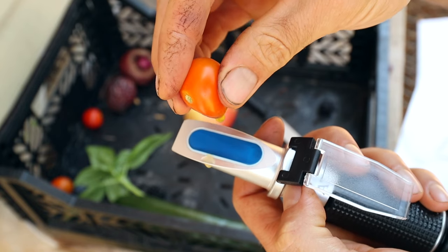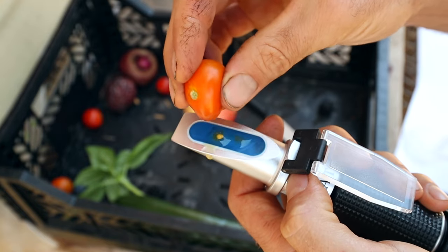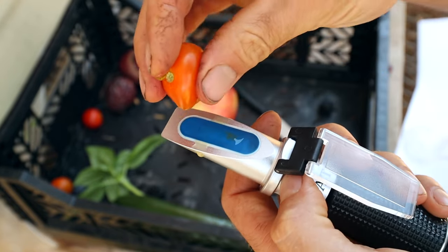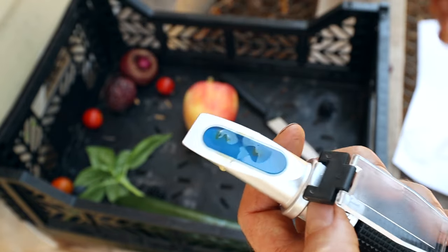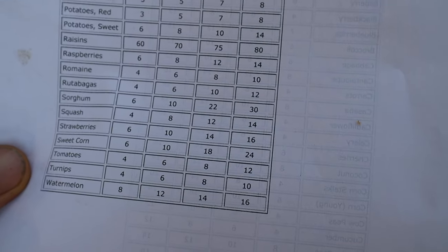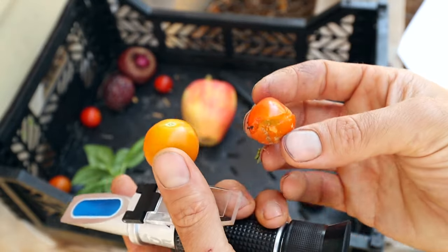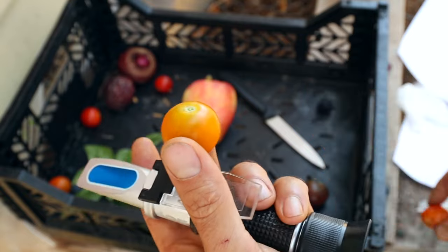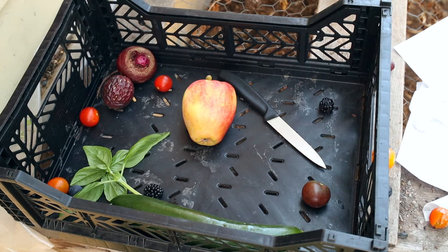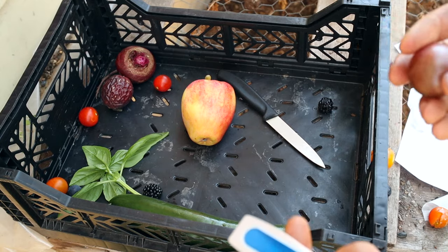Next let's try out one of our tomatoes — these are Sun Gold tomatoes, very sweet. I tested them earlier in the season and got 7.5 — let's see what they're testing at now. Wow, we got 9 — that's in between good and excellent. Pretty good, I'm happy with that. It looks like they got a little better as the season went on. Let's try one of the Sun Golds that was a little bit under-ripe and see the difference — that one's also at 9. Looks like ripeness didn't have as much of an effect as I thought.